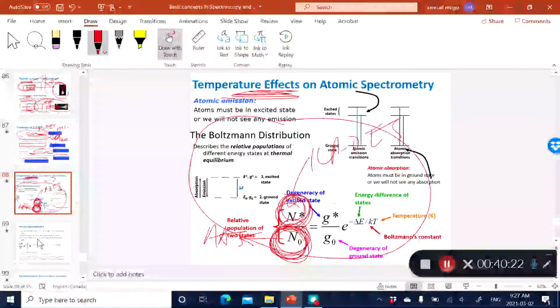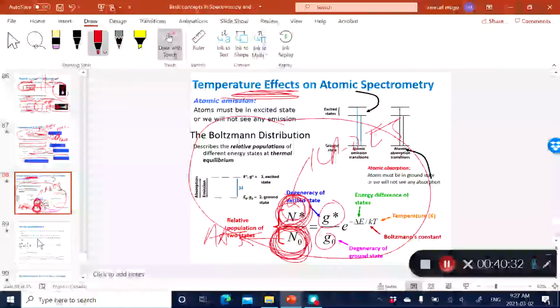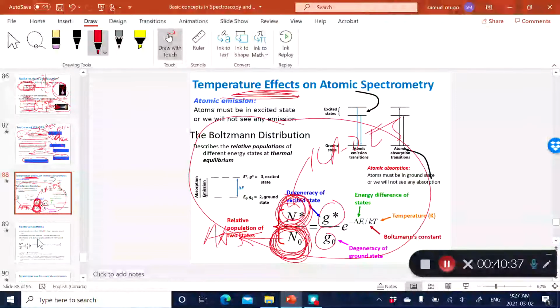And that is also based on the degeneracy. And degeneracy really means the excited states that are available for that atom, or electrons of the atom, to transition to. Okay? So if, for example, you're dealing with sodium, where you've got the 3s electrons being the outermost, the valence electrons, and then of course you've got the 3p fairly close to the 3s, meaning these electrons can transition from the ground state to an excited state on the 3p orbital.